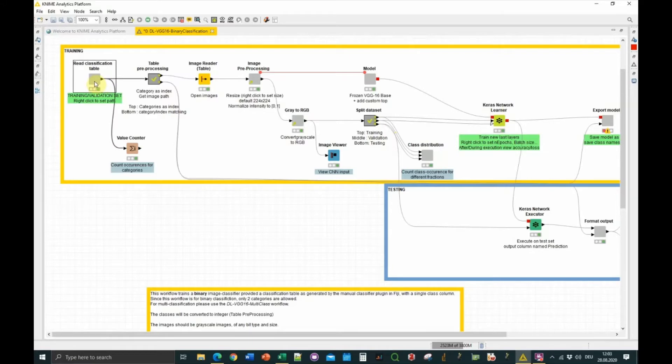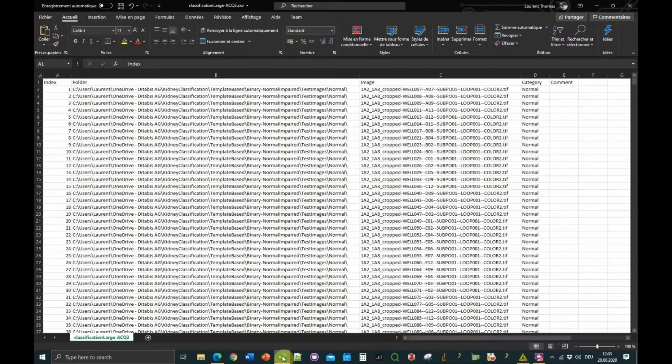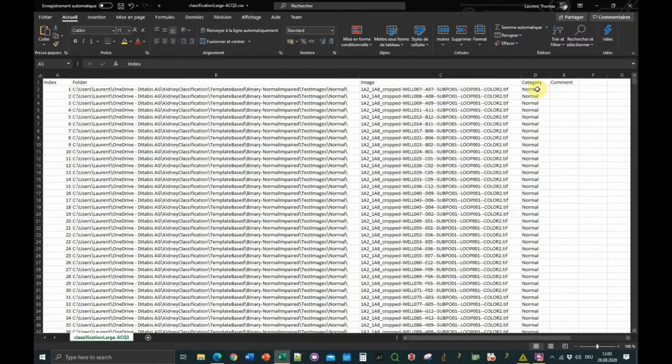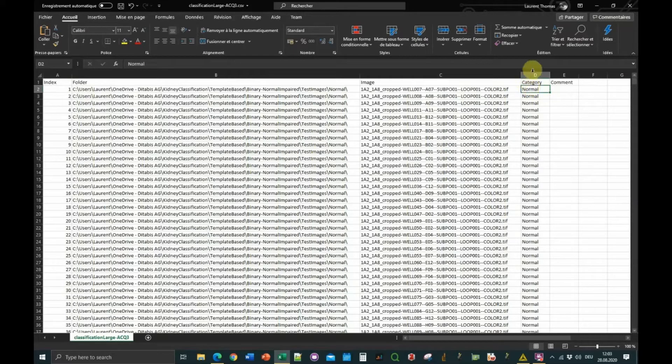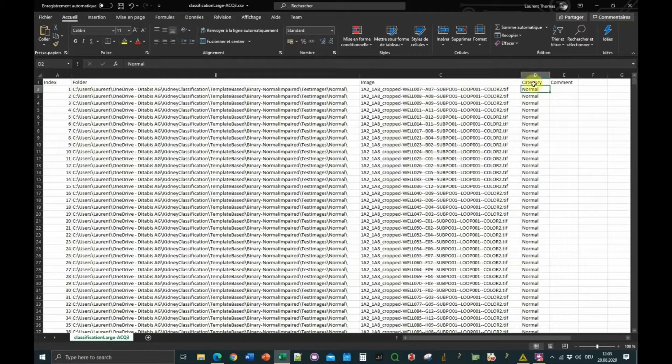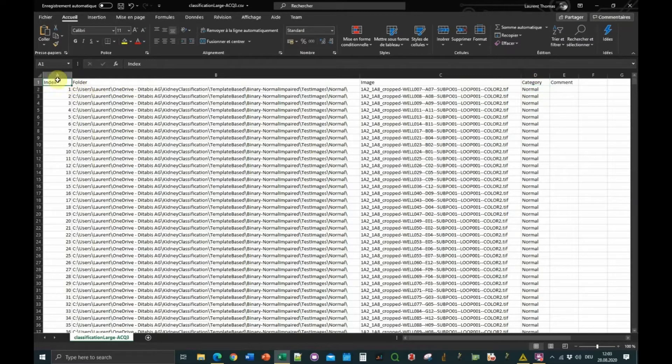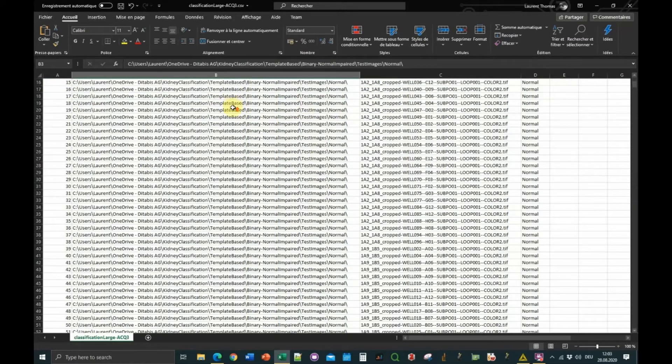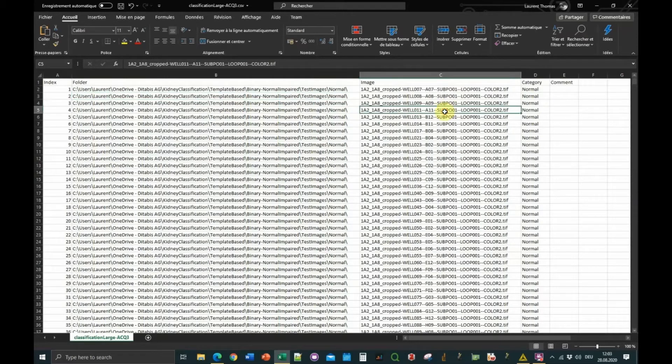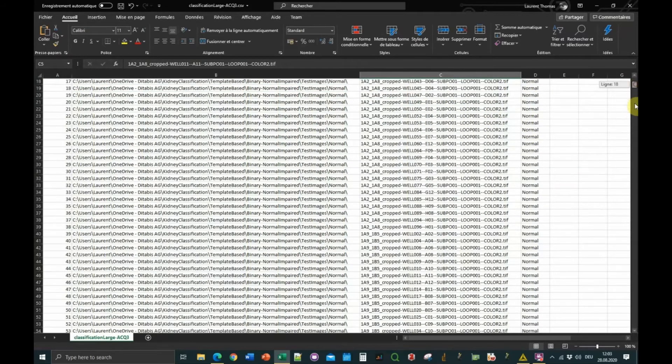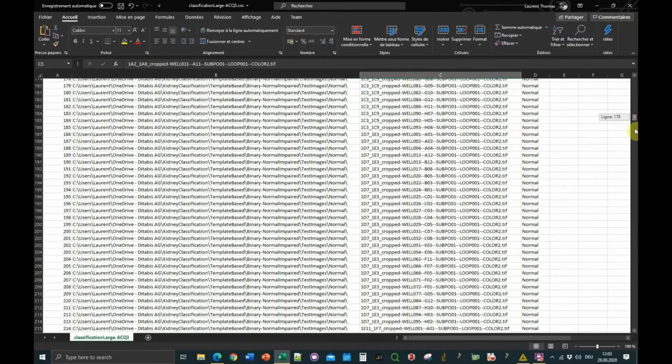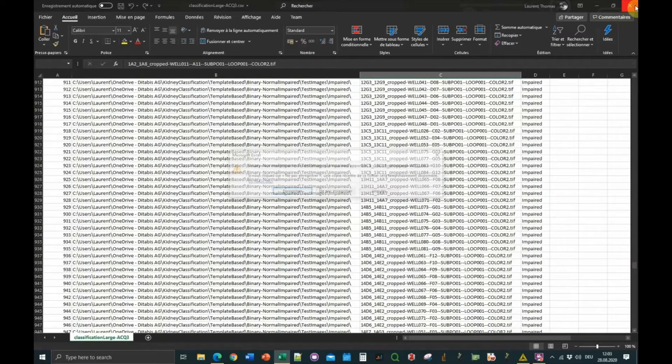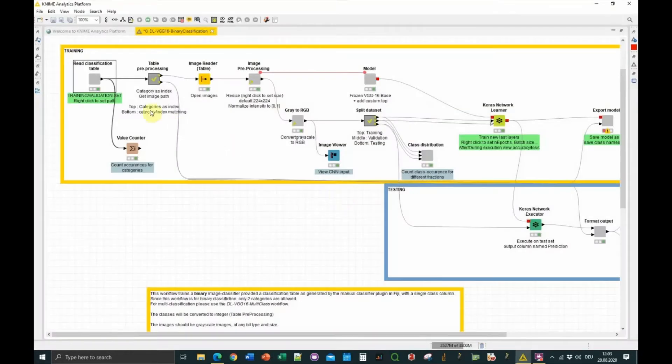The starting point is to load your dataset, the annotation table. In this case, I'm using an annotation table as generated by the single class classifier, because every image is only allowed to belong to a single category. The table should be formatted to a single category column. You see my directory and the file name and the category, so we have two categories: normal and impaired. This file I'm loading into the first node here, and we can look at the output, which is exactly the same as in the Excel file.